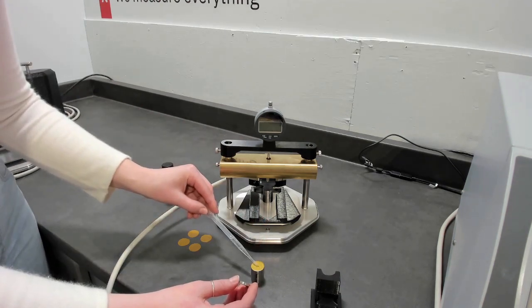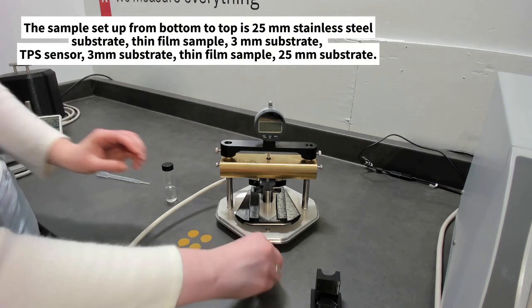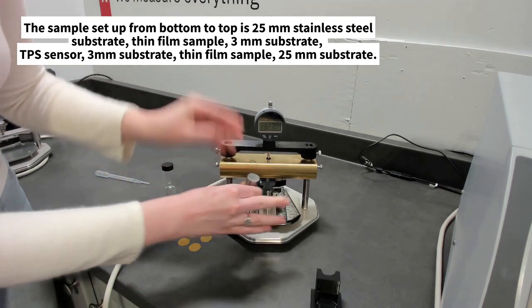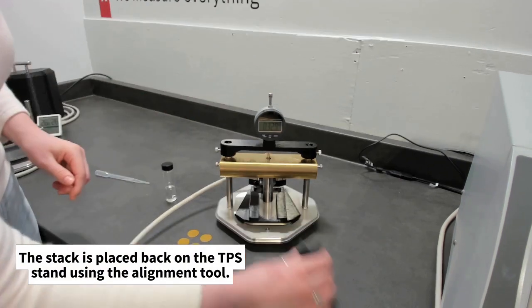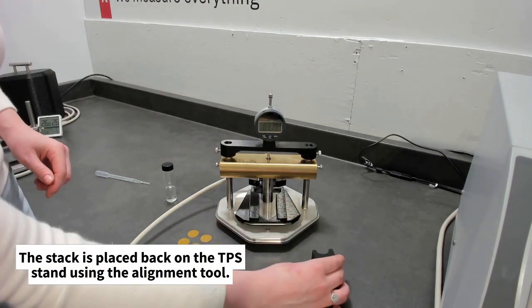We remove the effects of the ethylene glycol through the multi-layered approach. When we measure multi-layer, typically one layer, two layer and three layer, we get a thermal resistance that we can draw a line through.